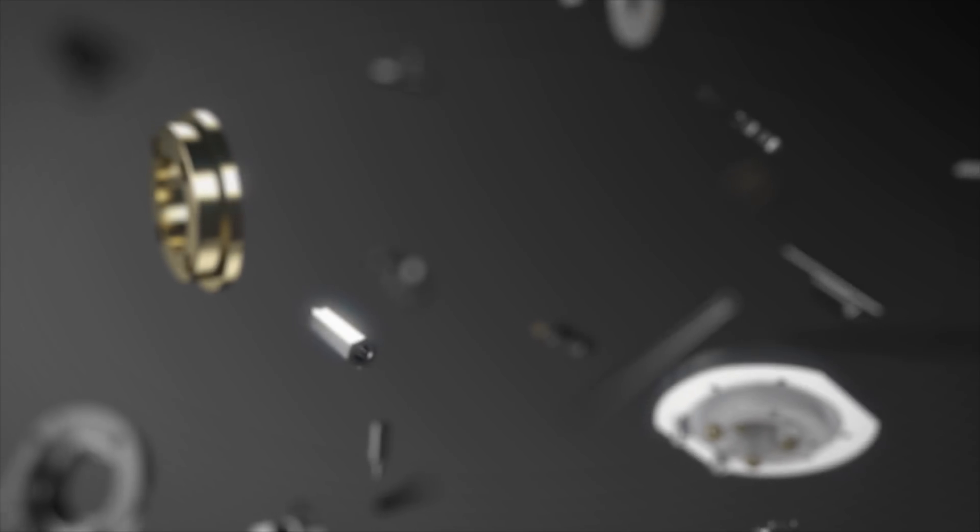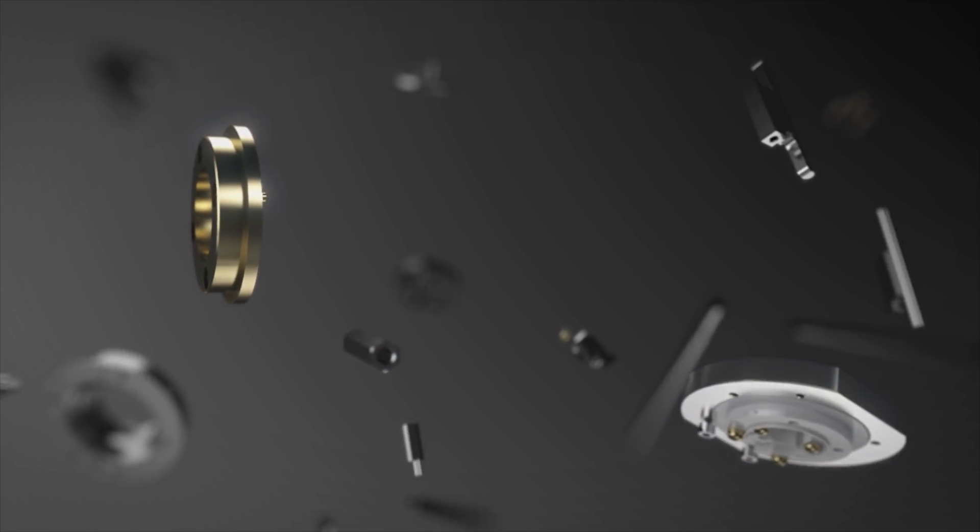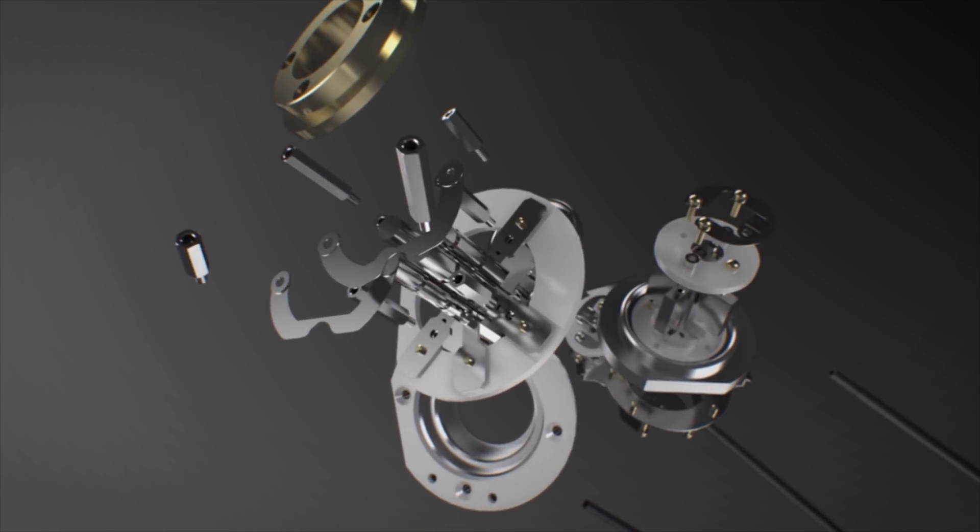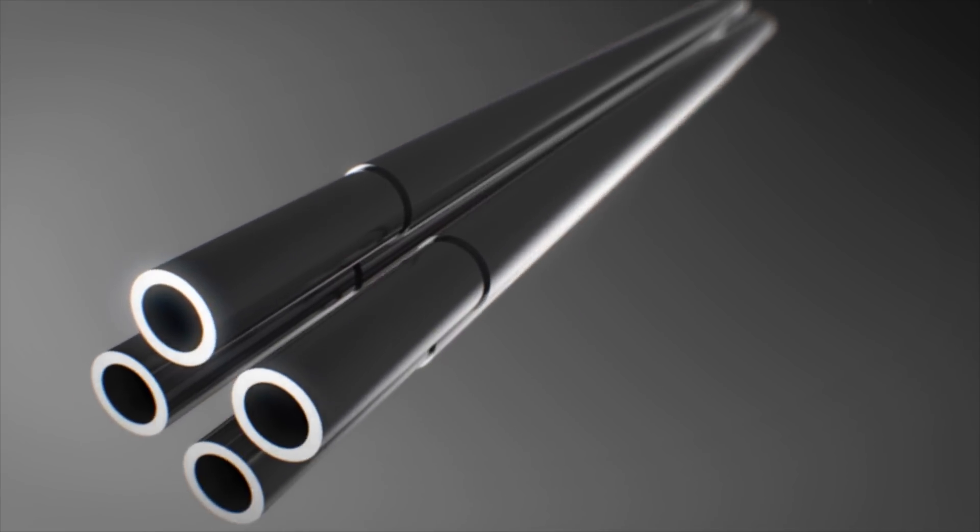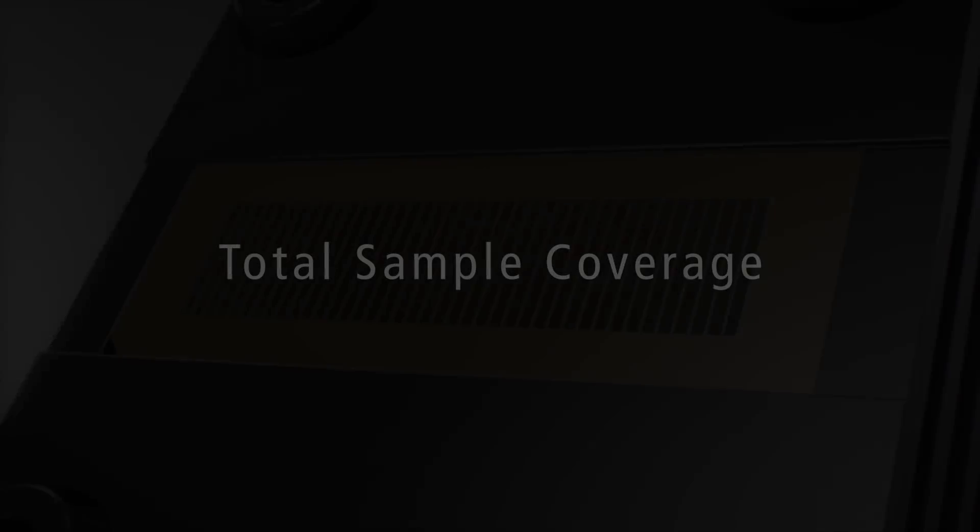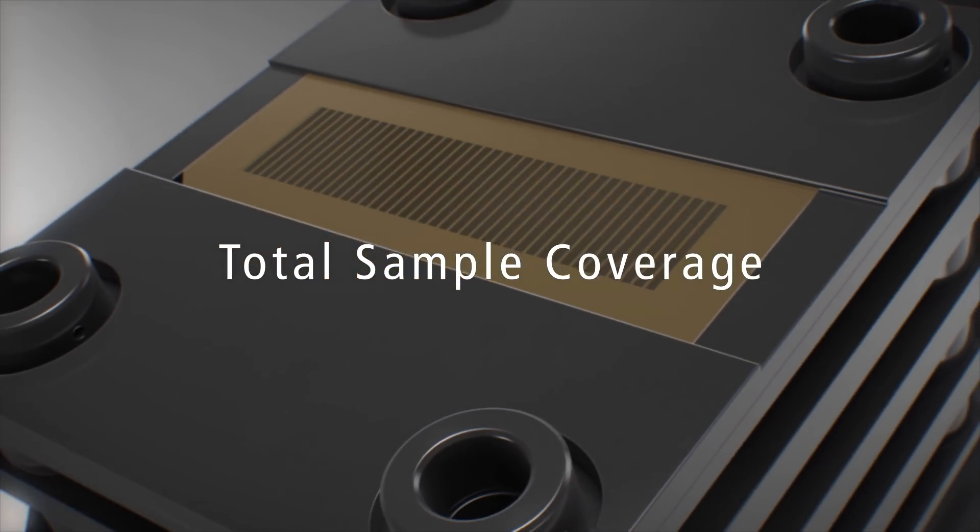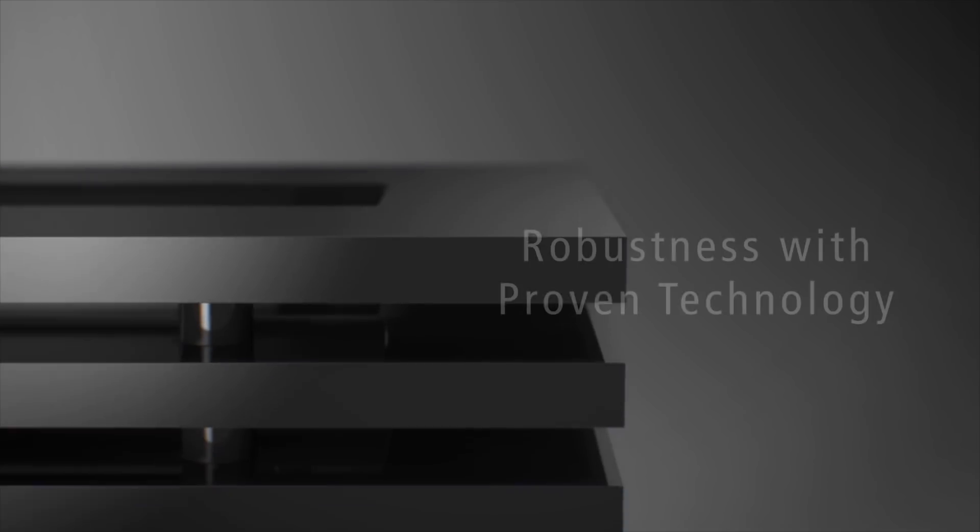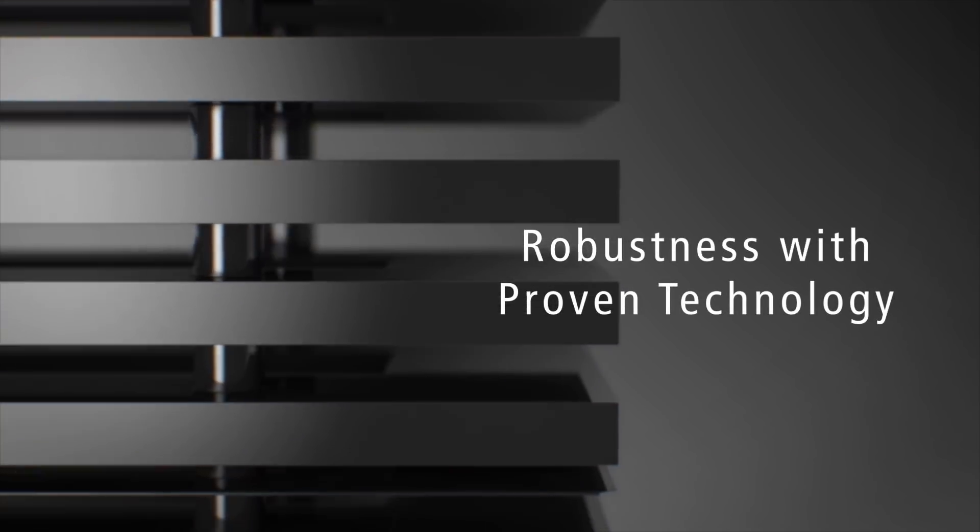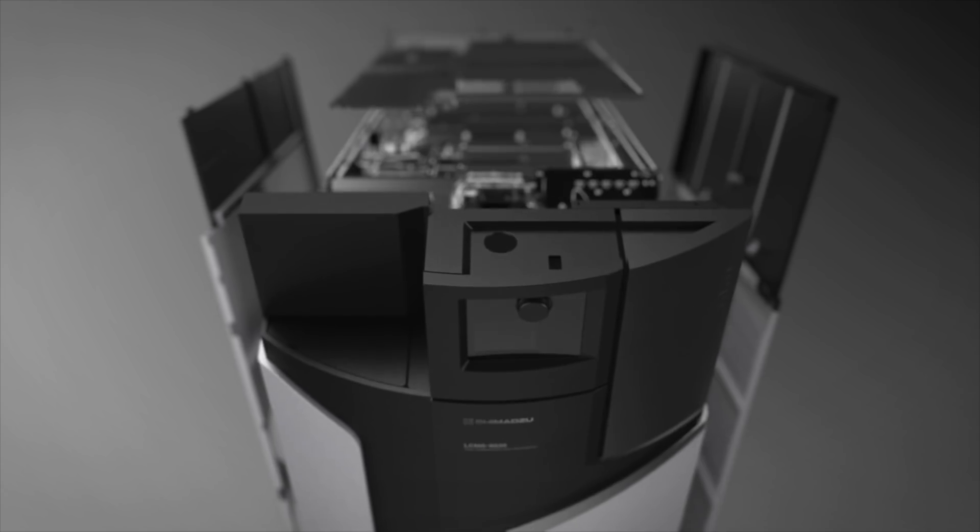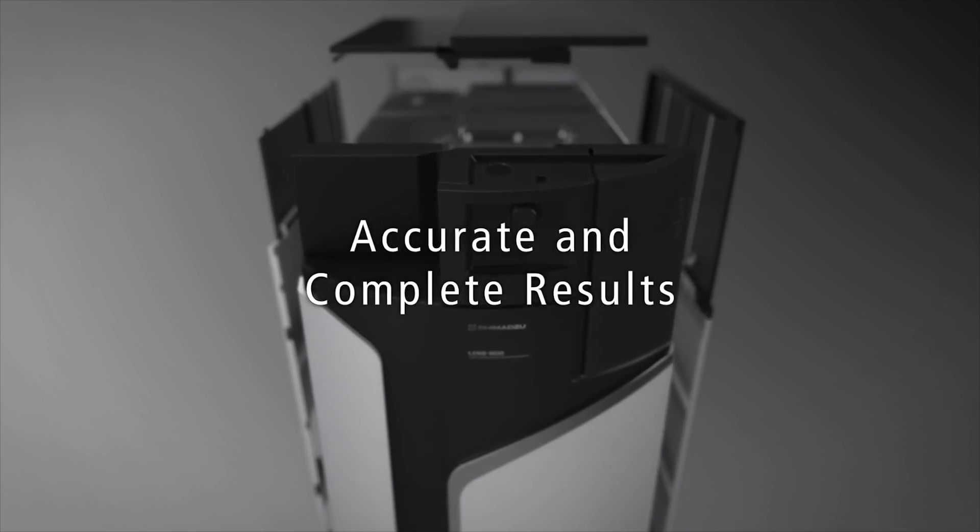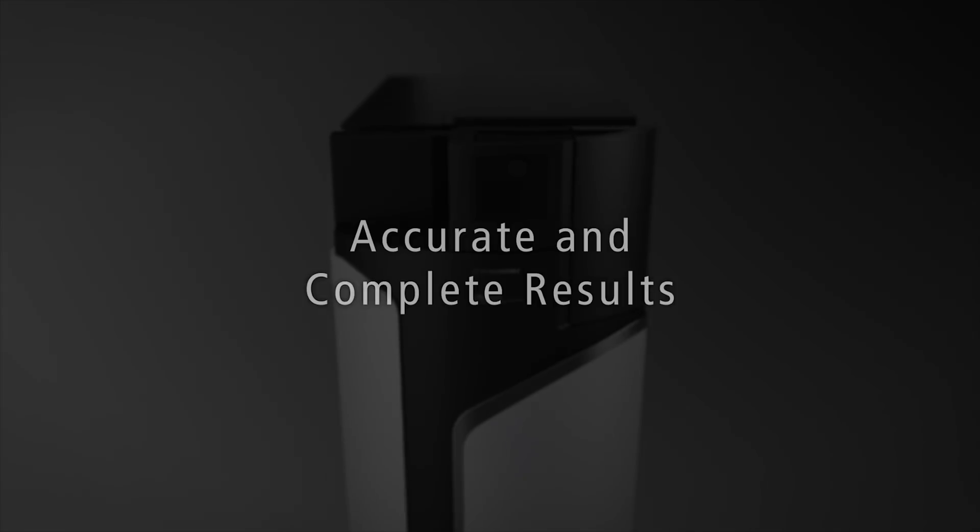Shimazu proudly announces the LC-MS 9030 quadrupole time-of-flight mass spectrometer. This new QTOF delivers total sample coverage, robustness with proven technology, accurate and complete results, perfect for every laboratory.